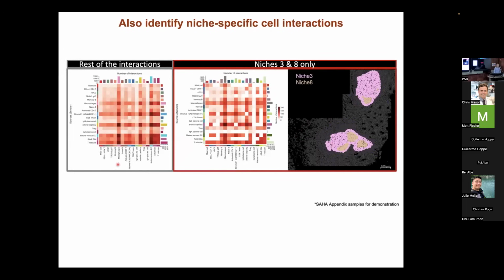So basically, this would give you essentially a prediction of the types of interactions that are present from within the different cells. Not unsurprisingly, usually the most likely interactor of a cell X is going to be with itself or cells like itself. But then this can allow you to identify ones that are a little more surprising, or maybe not surprising, but like here you have macrophages interacting most with arterial capillaries, which is something, again, that is known. So again, it's a good sanity check, but this gives us the hope that you can identify novel interactions or novel organizational interactions that haven't been really discovered before.